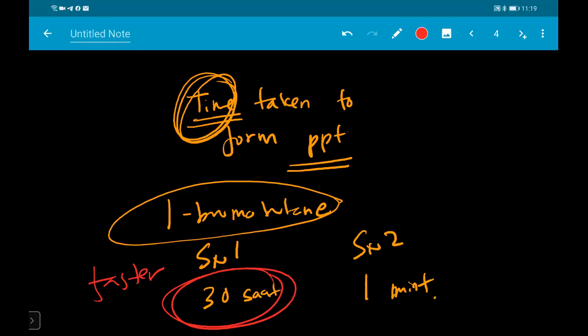Okay, ni bukan jawapan, you might want to check with the notes later on. So the idea is you're going to study which alkyl halide will prefer tindak balas yang mana satu. Adakah dia akan lalu highway ataupun dia akan lalu jalan dalam. It all depends. First factor is the type of alkyl halide.